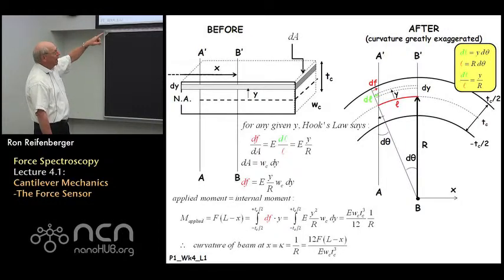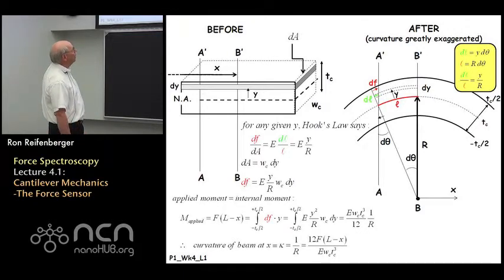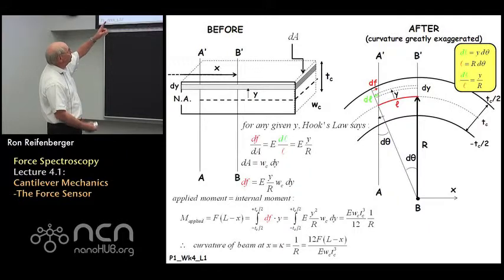To work that out, you have to refer to the diagram on the right side of the slide. It's basically just geometry. It shows a cross-section of the beam. The curvature's been greatly exaggerated, but I try to show the internal forces dF. I indicate by the green line the elongation delta L that occurs between the atoms inside the beam.